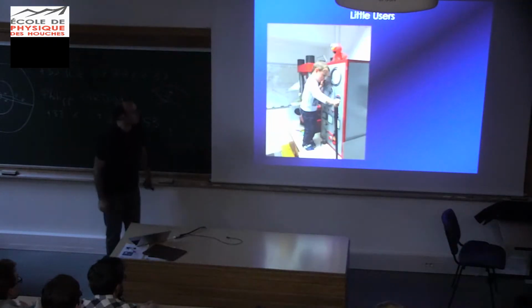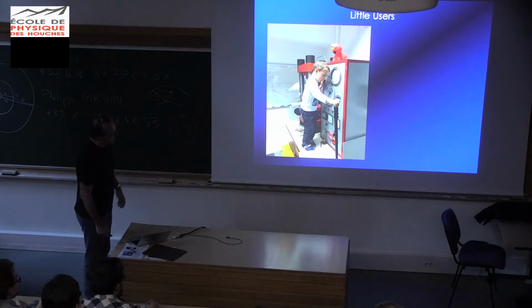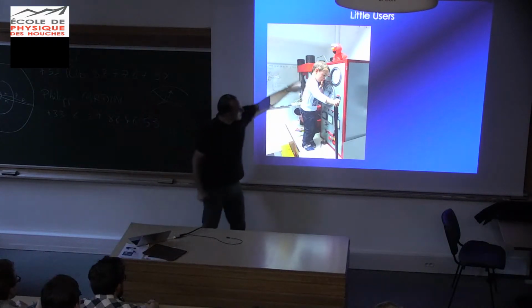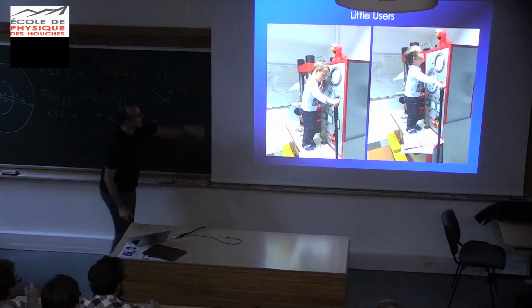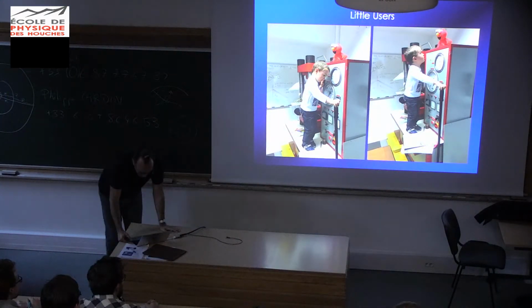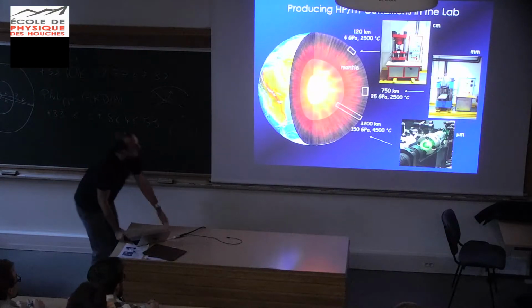So this is why we have the lever. Little users. That's my son playing with the machine. And even he can do this. So this gives you an idea of the size, right? And of course, instead of looking at the gauge, he's more worried about the little guy up there. But yeah. So this is for the piston cylinder.